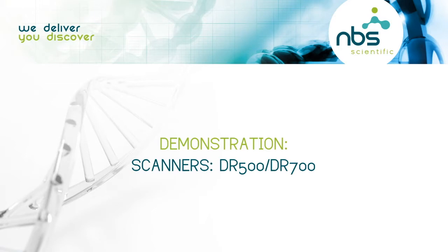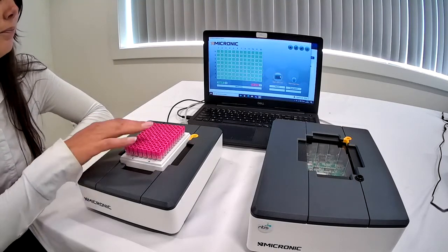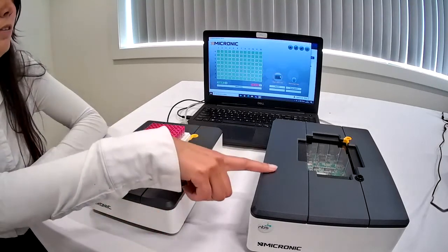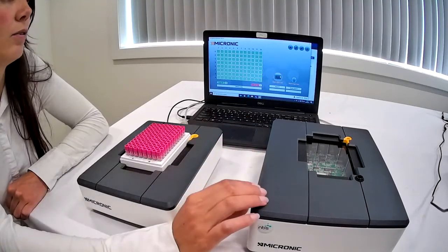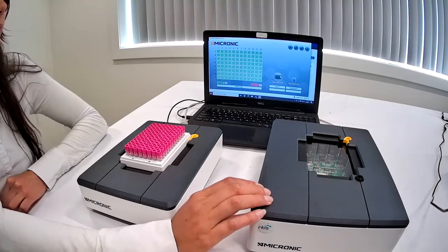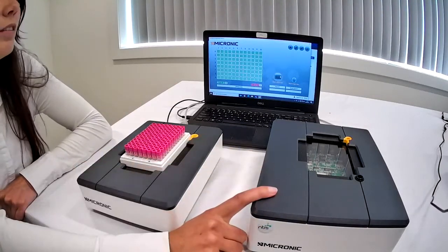So Grazia will give a demonstration of the scanners, the DR500 and DR700. Grazia. Yes, thank you, Martin. So yeah, we have different types of scanners, as Martin also told. This is the DR500, the left one with caps on it, and this is the standard scanner. On the right side, we see the DR700. This one has the deep imaging camera. It's also a little bit bigger because of that, and it also has the plate to scan from the freezer. What's different is the sizes, of course. You can see that this one is a little bit smaller than this.